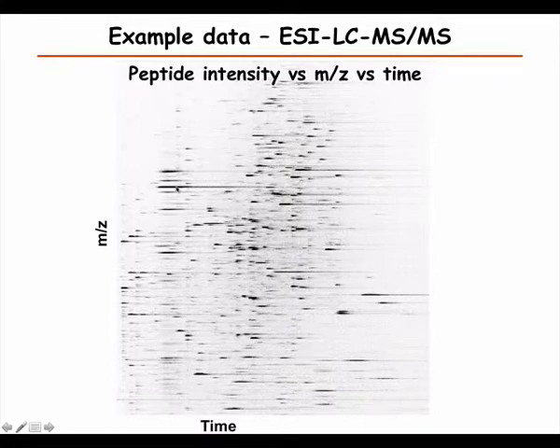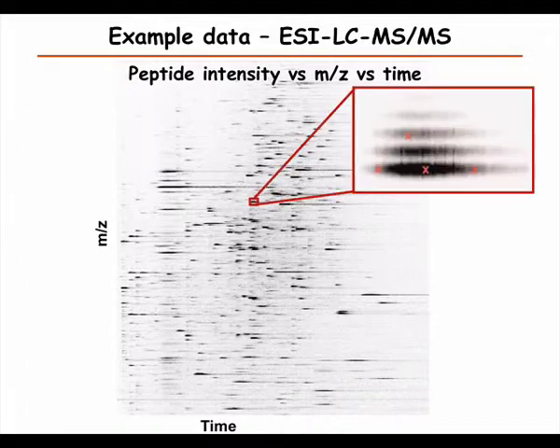In general, a peptide will start appearing at some time and then go away after a little while. But as you see, this is the ideal case, but sometimes there are these streaks. It's a peptide that appears, but then there's a very long tail, which one should definitely avoid if possible. But chromatography is usually quite hard to do properly.